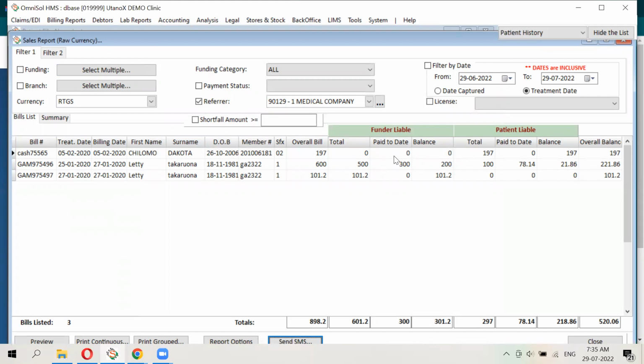We don't have a one-size-fits-all pricing, because over time, we've learned that if you do that, you risk underserving a client because you did not anticipate their requirements and their need. So it's always, you might say, price on application, the way you do with a Bentley. Okay. So if we're using the cloud-based or web-based server, then it means it will be easier for all these labs in Harare to be able to access the database without too much infrastructure inputted, right?